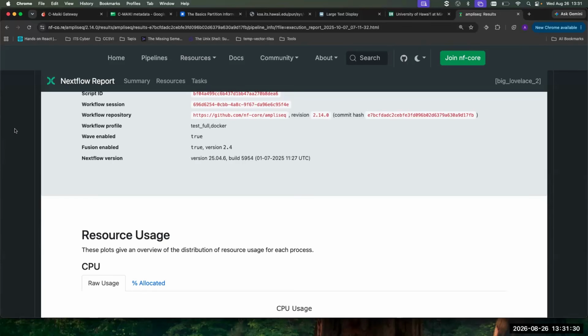These tools are for students who are mostly focused on ecology or mostly focused on culture-based microbiology. They have other interests besides bioinformatics. And they just need to get a quick community profile or get a quick analysis done that's reasonably good. If you really want to optimize, then don't use the gateway. Use command line interface.